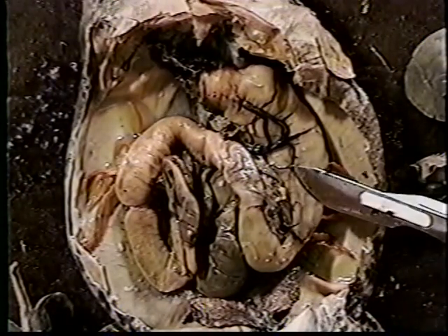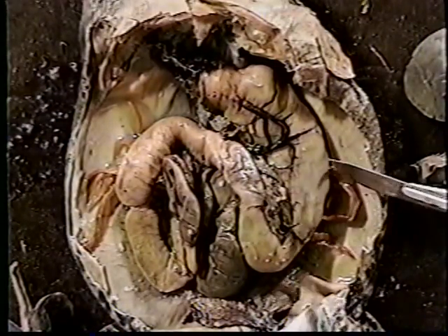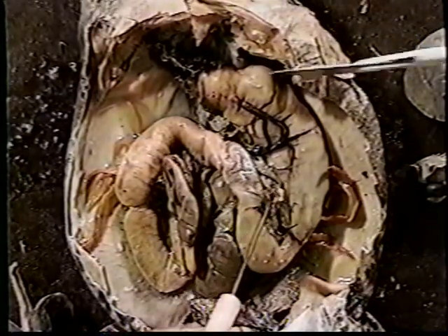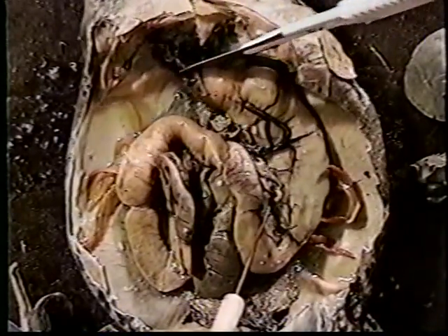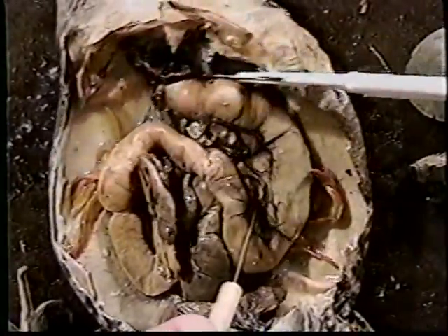Now we can examine another system, the reproductive system. In order to be able to do this, though, we need to eliminate the stomach as well as the intestine.